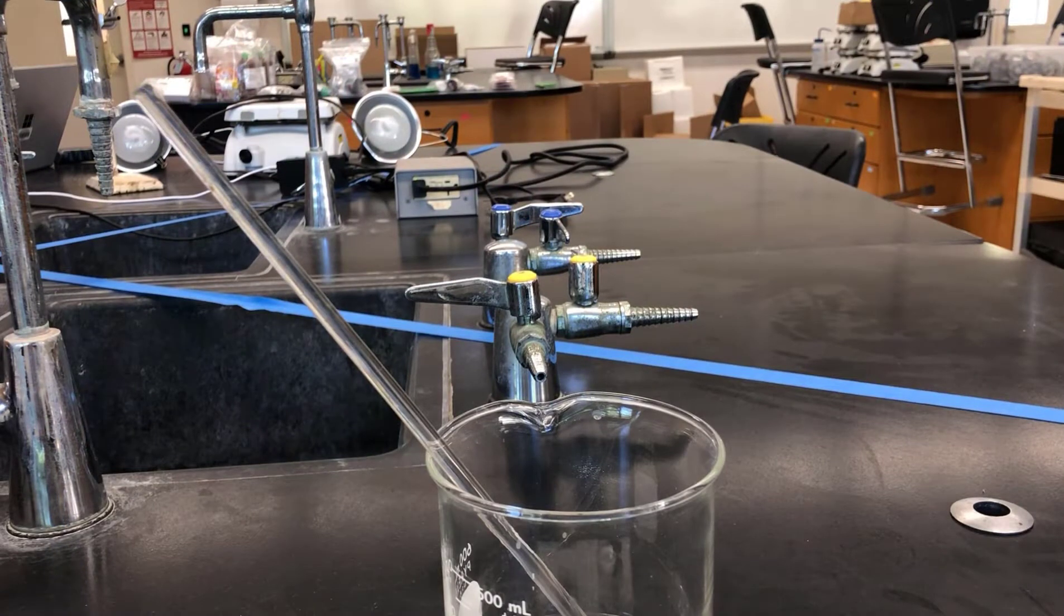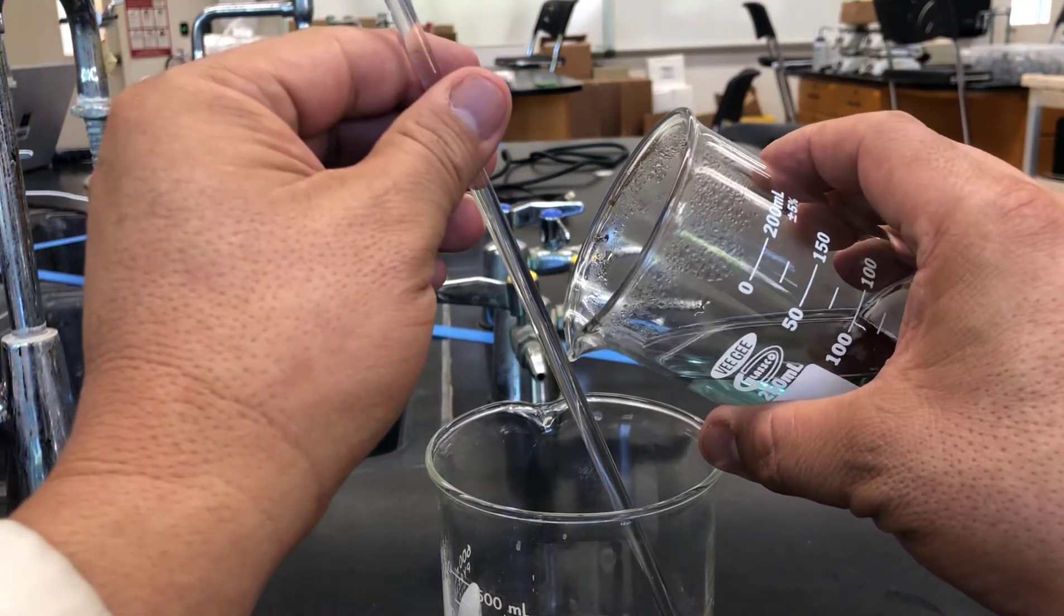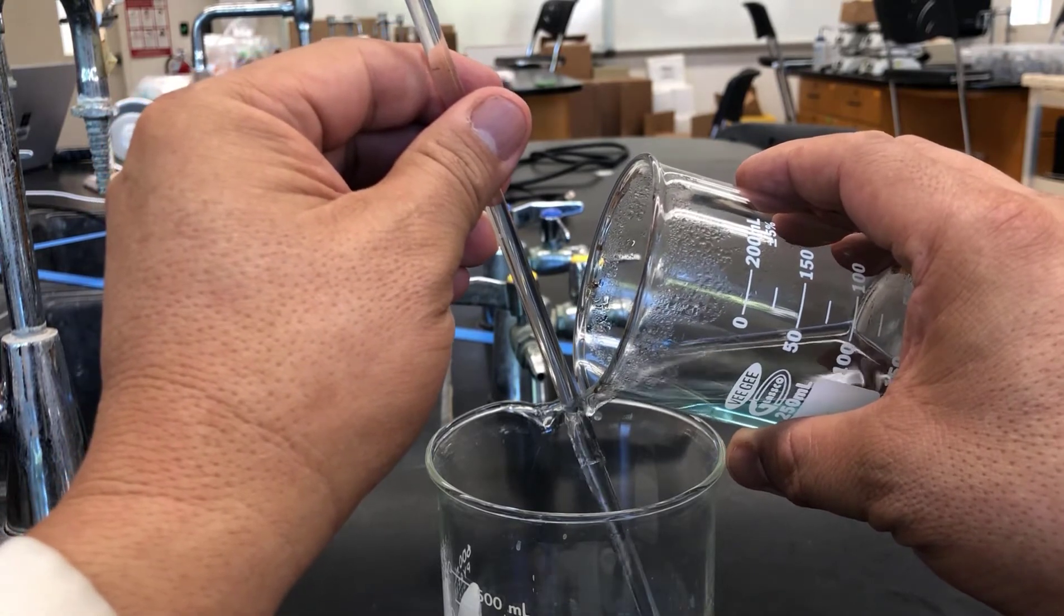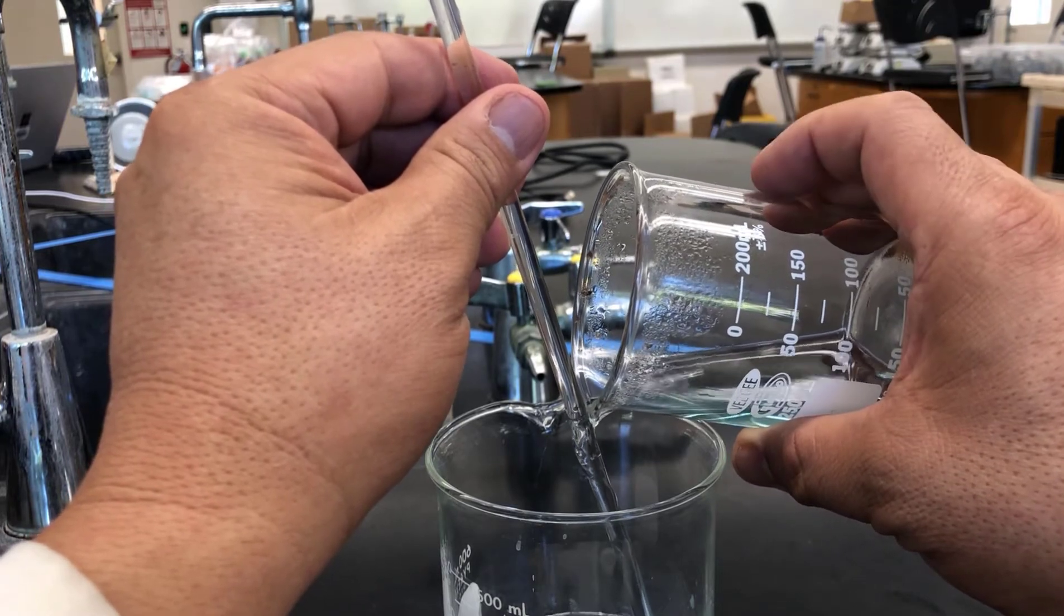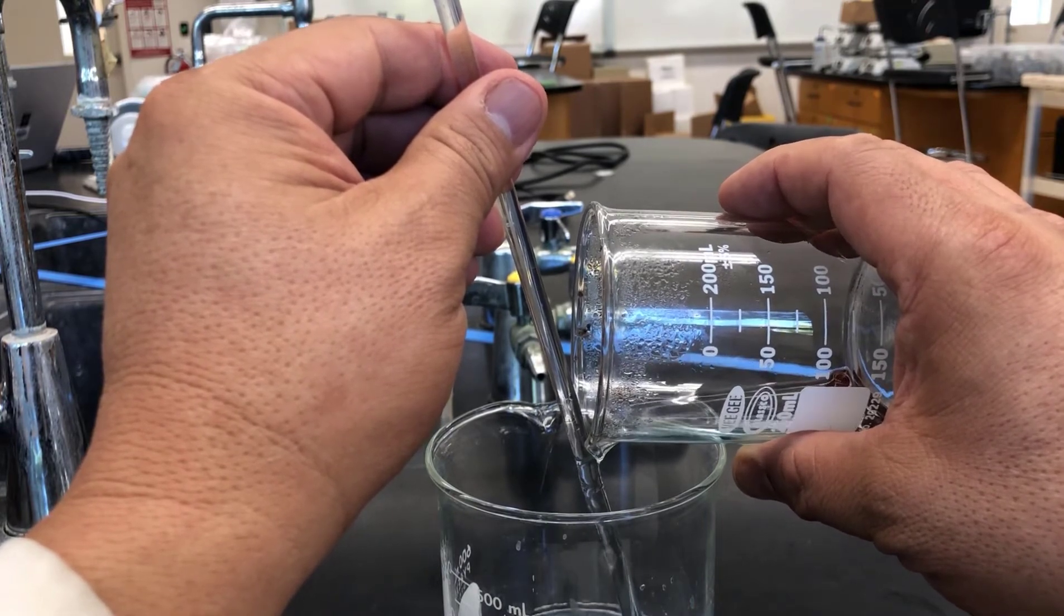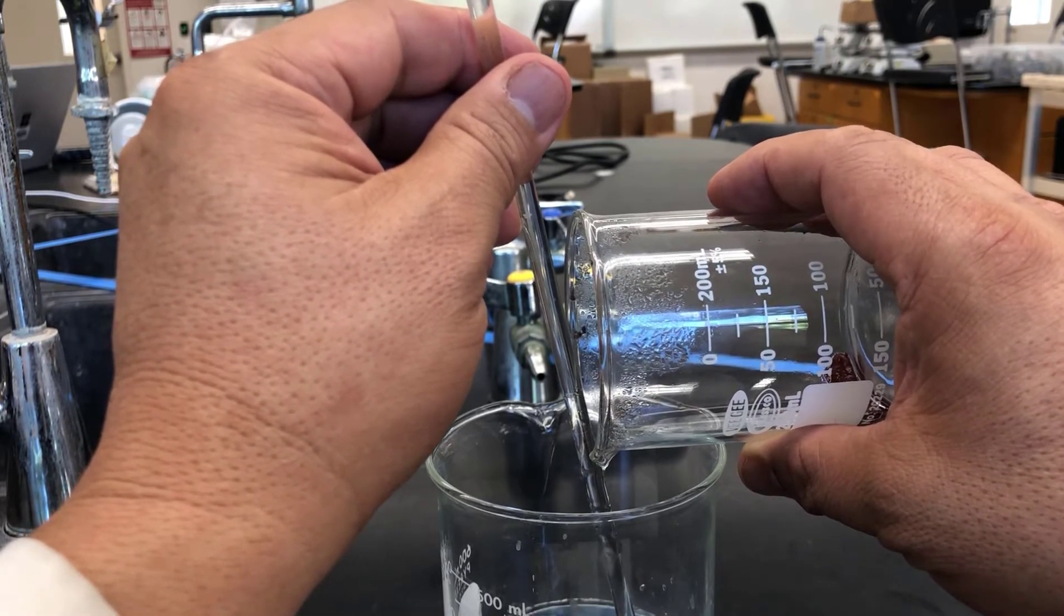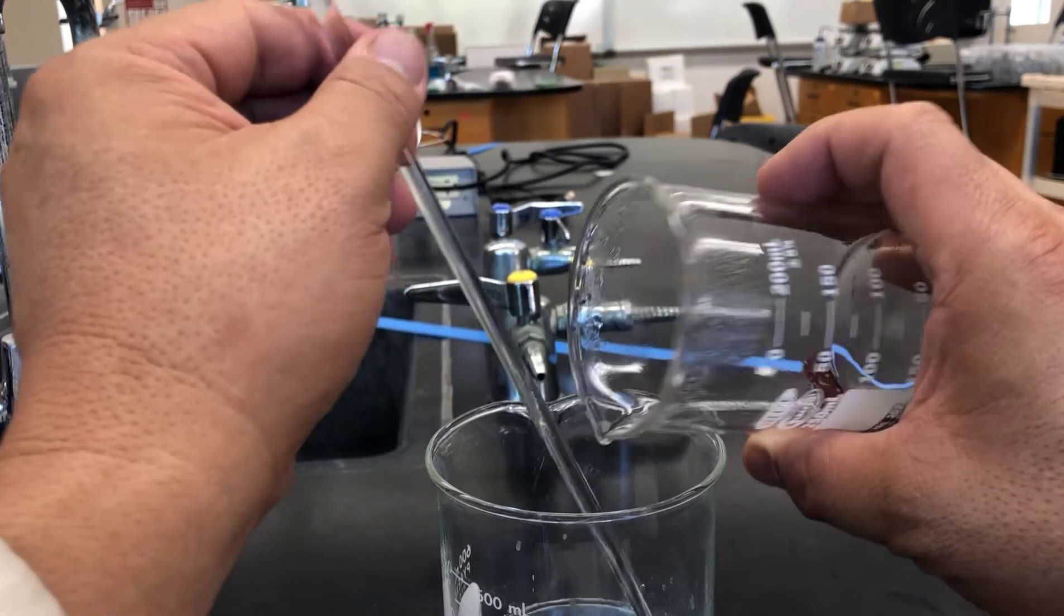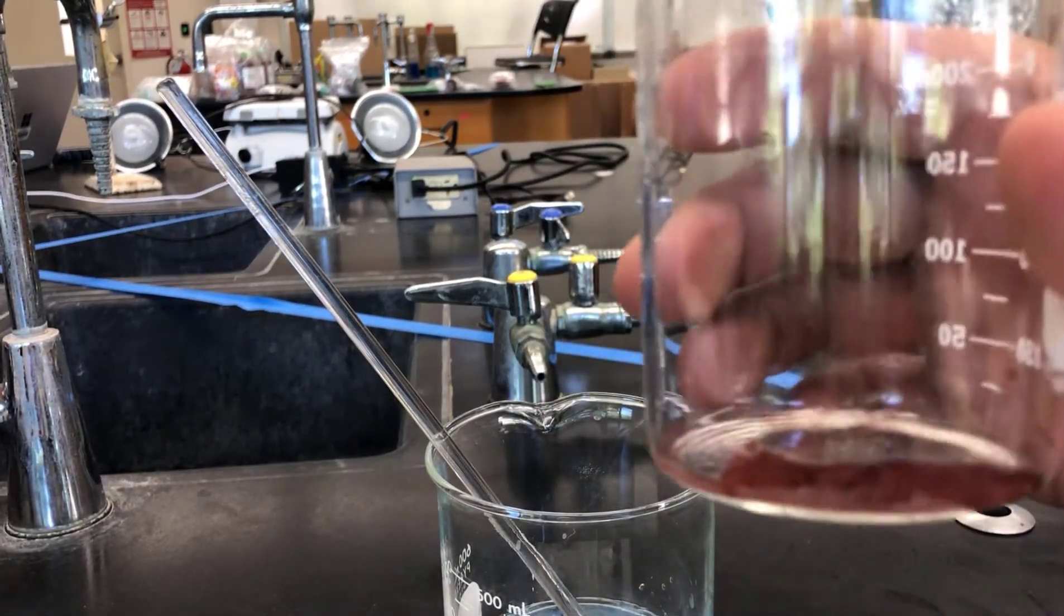Okay. So we're ready to decant into our waste beaker. And we'll try to do that without losing any copper. I've let it settle for quite a while, so it should be pretty good. It's done a really good job of separating without losing any of the copper. You'll notice it all stayed down at the bottom right there. That's what our copper looks like right now.